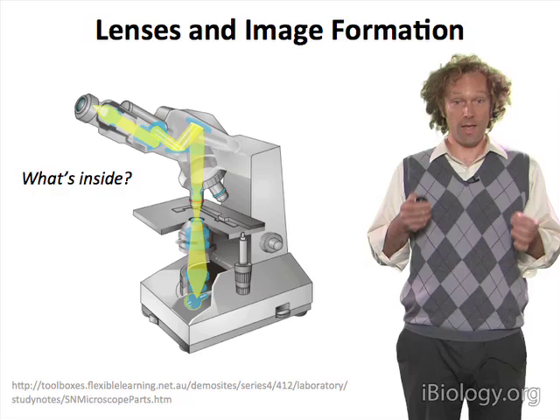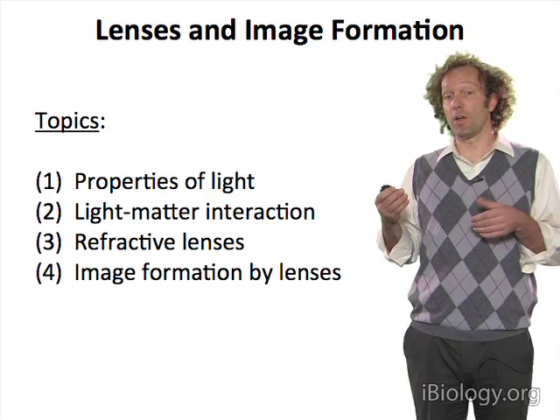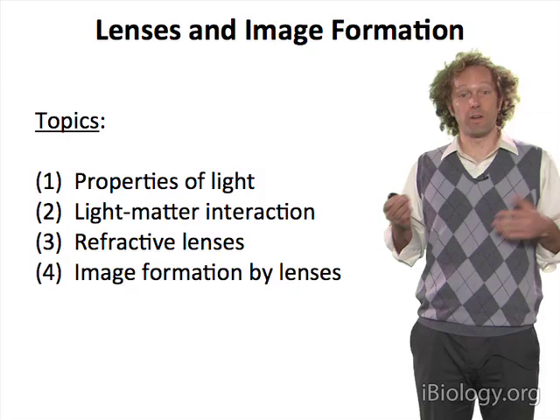So this lecture will talk about four main topics. I'll start with the properties of light, what they are, and how they are involved in moving through an optical system. Next, I'll talk about light-matter interactions, the very simple and basic concepts of reflection and refraction.